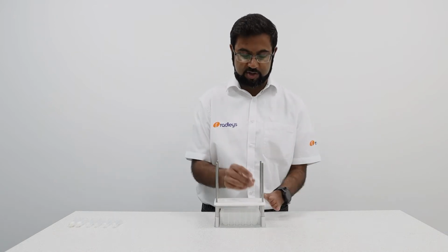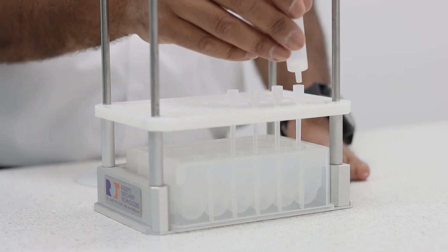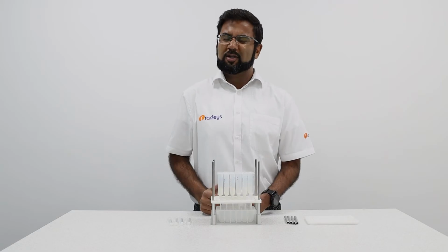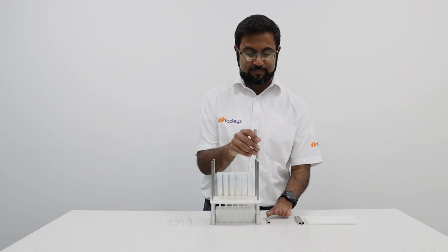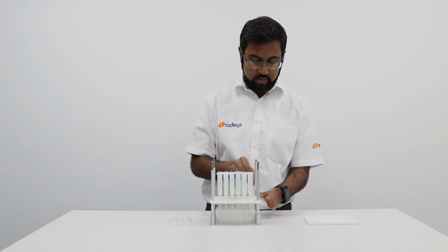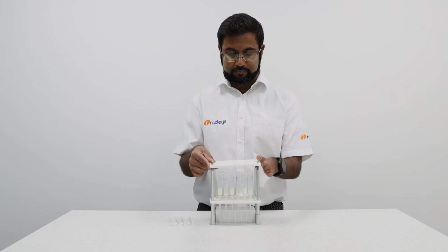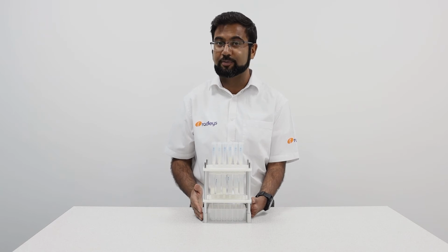The next step is to insert the polypropylene needles into the support plate. Once these are in place, you can then select your columns that you wish to use. For a 2-stage workup and purification, place on the aluminium inserts, and then add on your upper support plate. And now you're ready to do a 2-stage purification and workup.